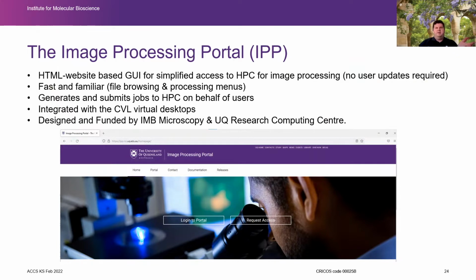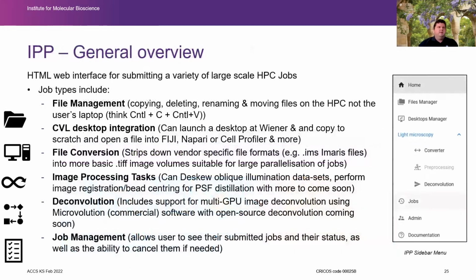It's fast and familiar with file browsing and processing menus that are intuitive, and it generates and submits the jobs to the HPC on behalf of the user. So there's no Slurm scripts or anything required there. And it's fully integrated with the CVL virtual desktops here at Wiener. And it's designed and funded by the IMB microscopy internally and the UQ RCC computing.